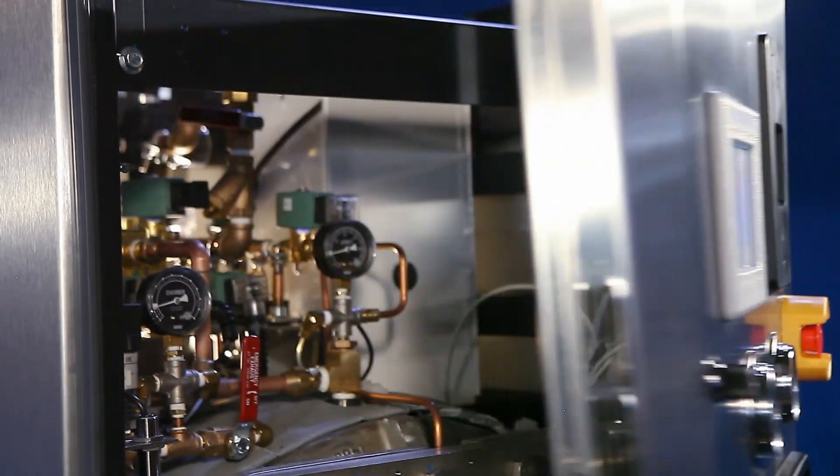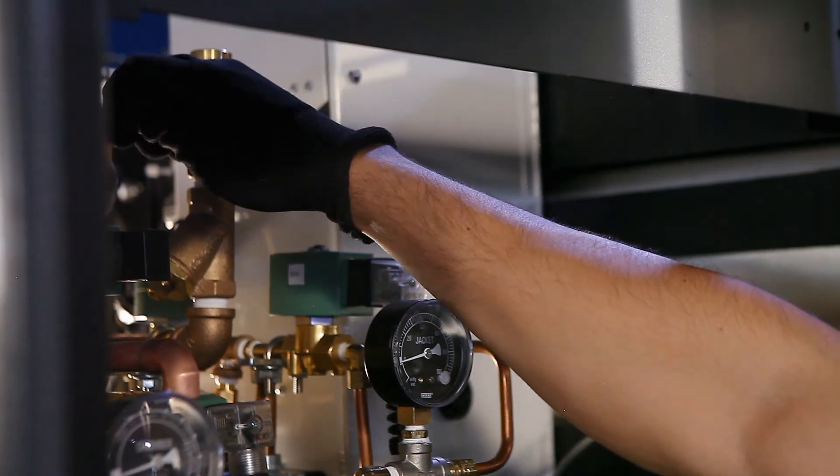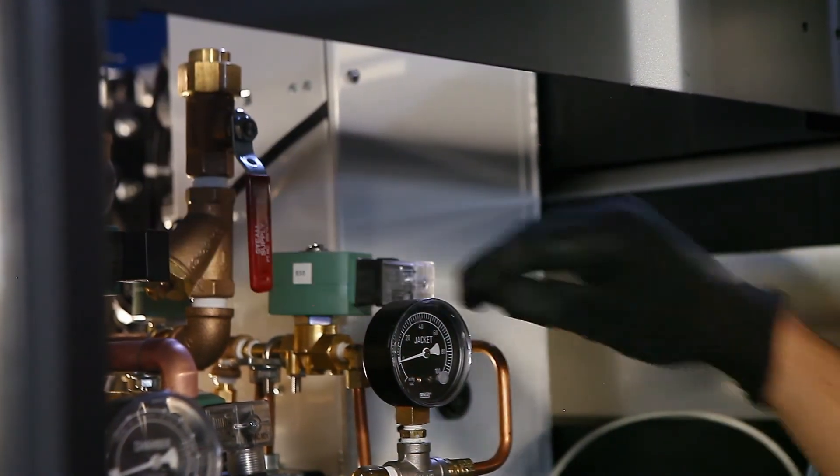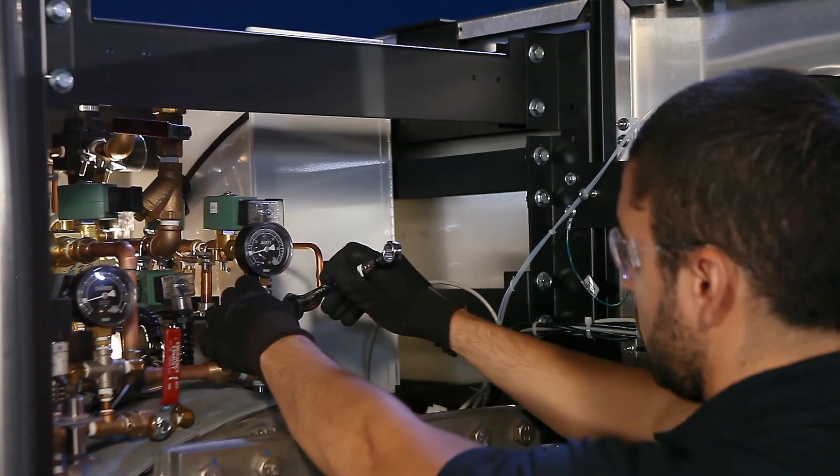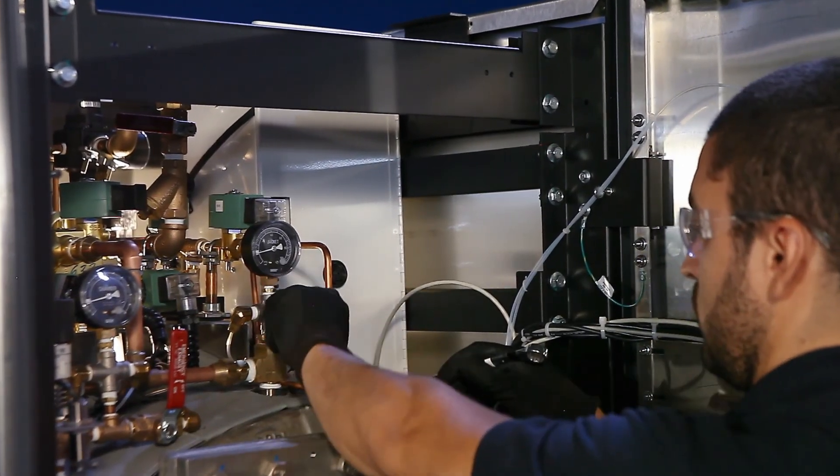Steris' expansive network of trained service technicians are located around the world and able to provide scheduled preventative maintenance along with exceptional response time for unscheduled needs.